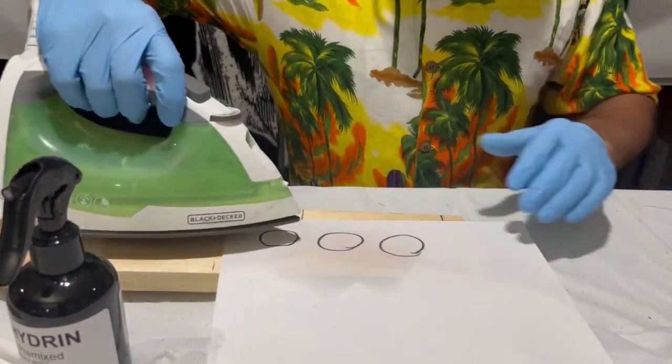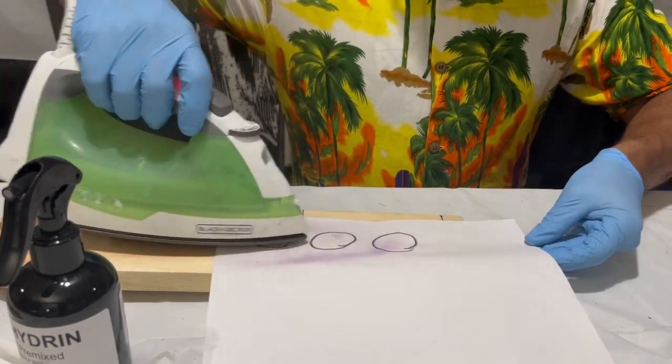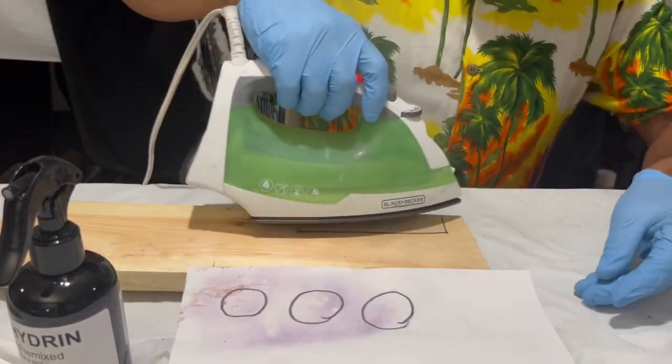I've waited two minutes. Now I'm going to use my iron to heat the fingerprints. The fingerprints are going to turn purple once they're heated. I'm not putting the iron directly onto the fingerprints — I'm letting the steam do the work.